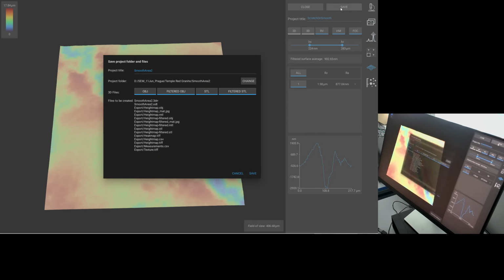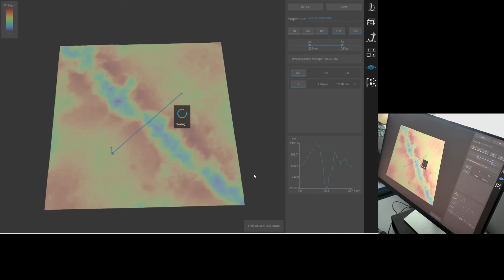I think I need to leave it there, but that is very interesting. Shame we couldn't get the sample down low enough to do really nice SEM, EDS, but we saw that it's the usual sort of granite composition.